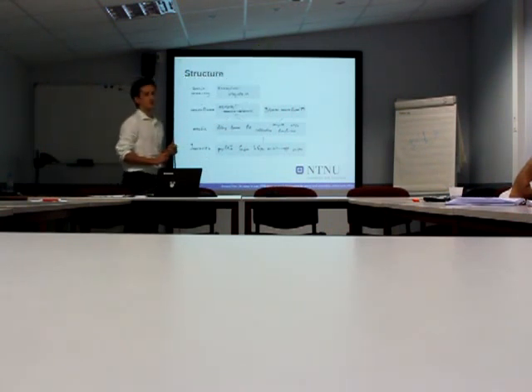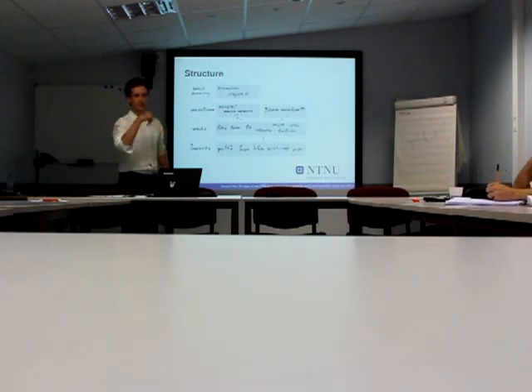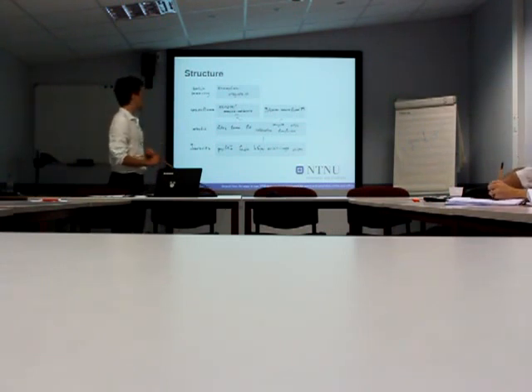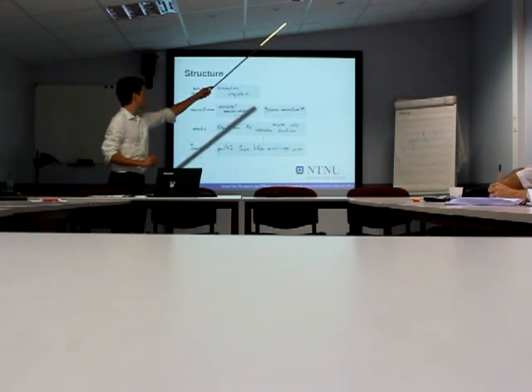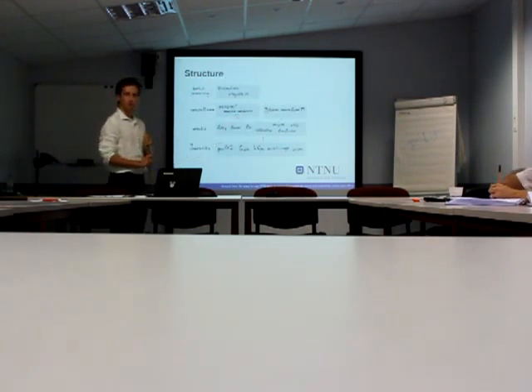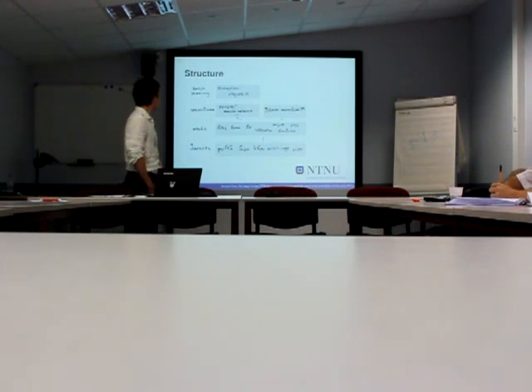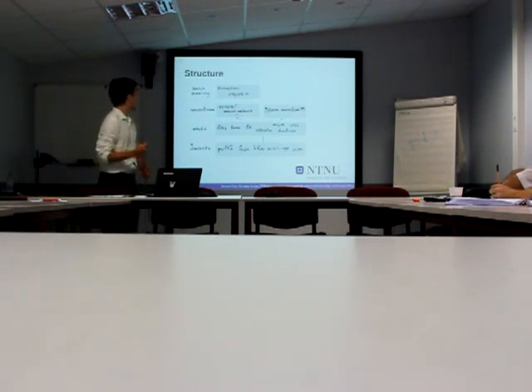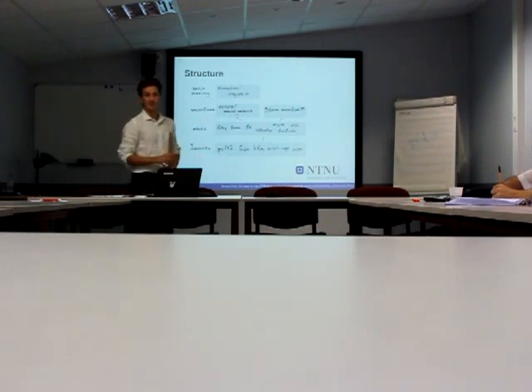That's just an interface. I've gone for just a command line. You go to the command line and you have these X-ray lib dash, calibrate, integrate, sample, and so on. We just use this module. So an alternative way could be to make some Dawn workflows, which also is Python based, but this is on the to-do future. Finally, just for convenience, there are some example shell scripts for if you want to do a whole lot of integrations. Depends on the file structure and so on, and each beamline, so that could be provided.